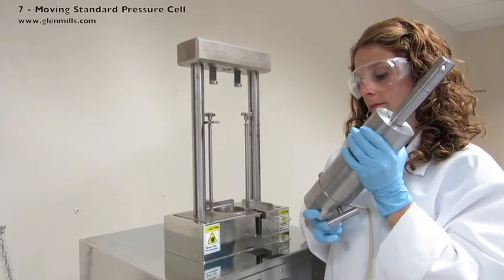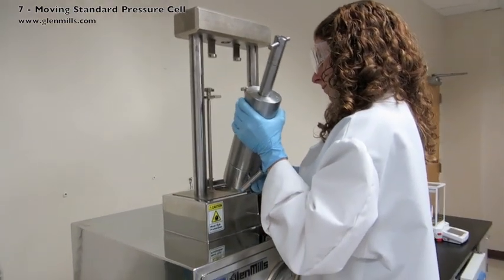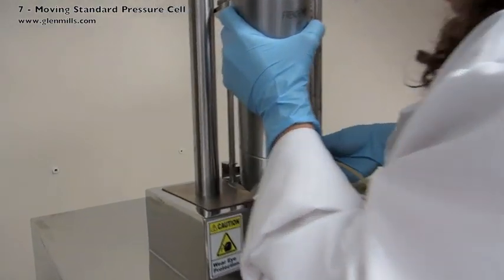Support the bottom closure plug to prevent it from dropping out of the cell body. Lift and insert onto the ring on the bottom platen.